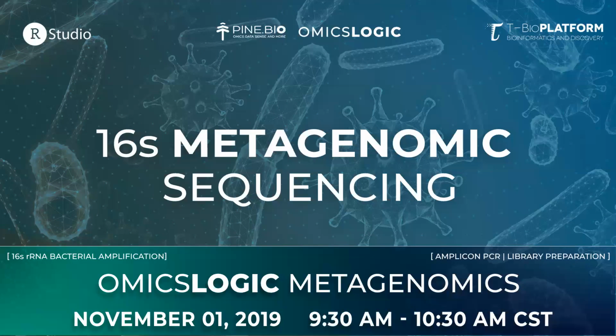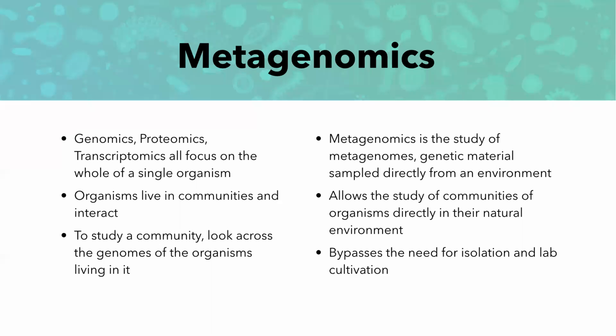So this session is really going to be dedicated to 16S metagenomic sequencing. But before that, I want to start with a little bit more background about sequencing itself. What's unique about metagenomics is that all the other omics are really focused on a single organism, right?